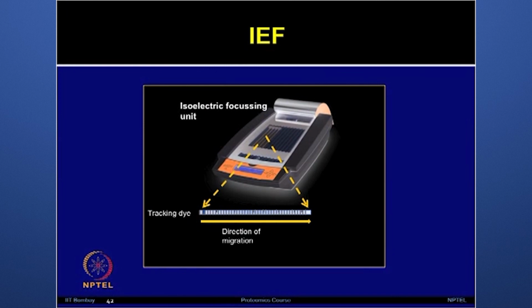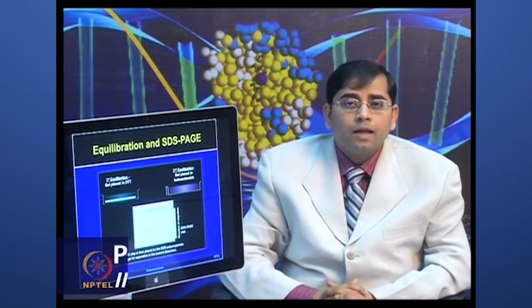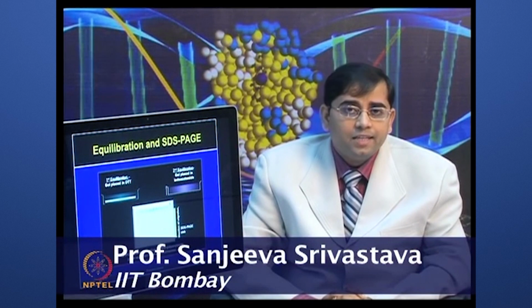It is a good idea to avoid any light exposure during the rehydration, dye reconstitution process, as well as while the isoelectric focusing run is in progress. Once IEF is done, again you have to do the equilibration, first equilibration and second equilibration, followed by SDS PAGE.